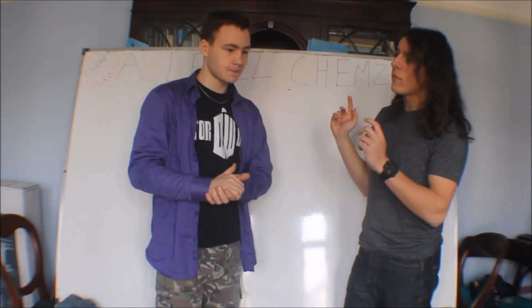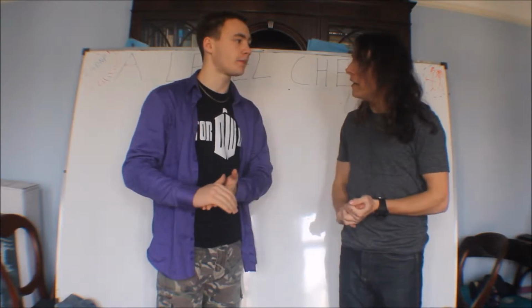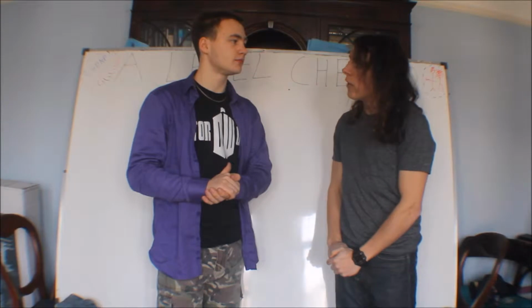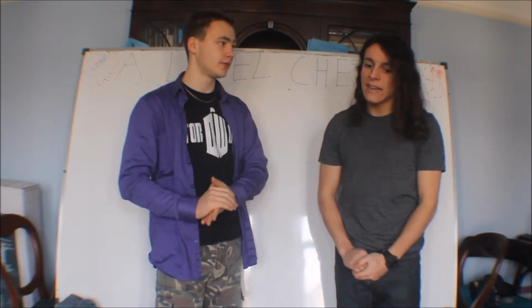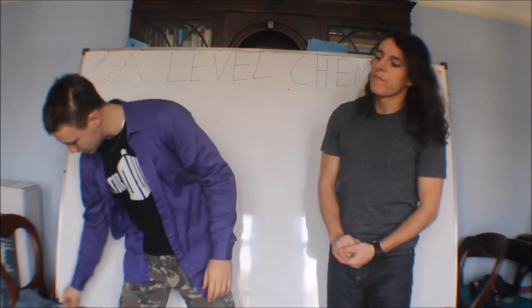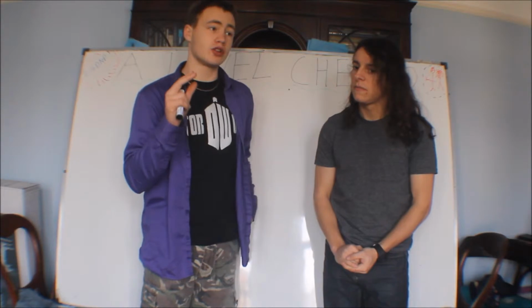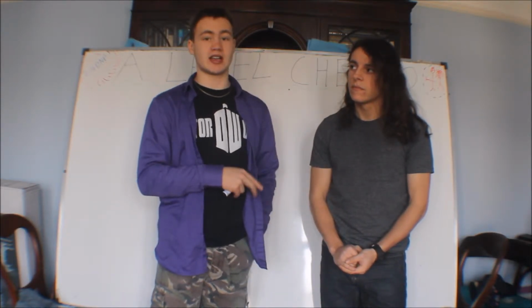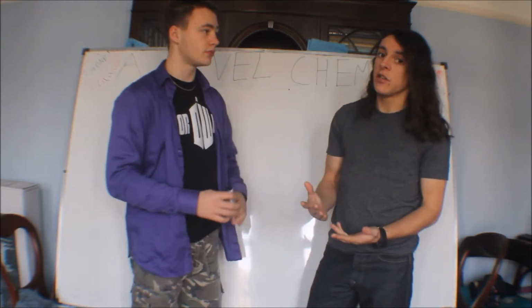So, I invented this thing the other day and it turned out someone had already done that. It was called Brady, and they made a reagent. I was going to call it Triv's reagent. Right, so that's when you distinguish if it's a carbonyl group or not, isn't it? Yeah, that's what you use it for. So what this is going to do is narrow it down hugely if it's a carbonyl group, so that could either be a ketone or an aldehyde, because it doesn't detect carboxylic acids or some of the esters.